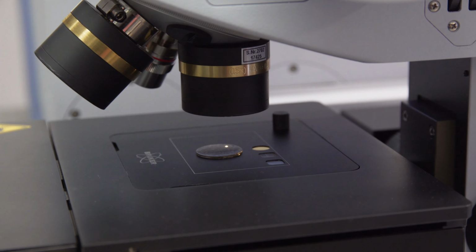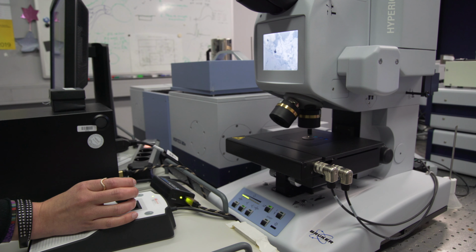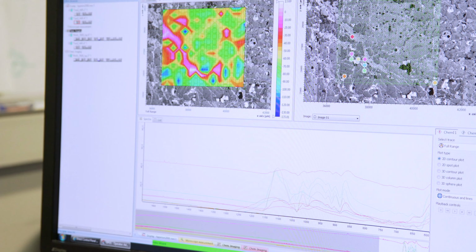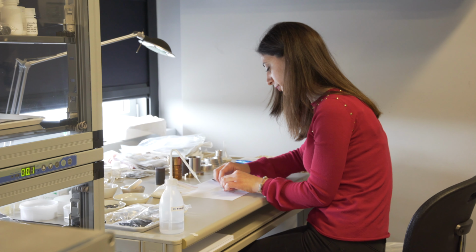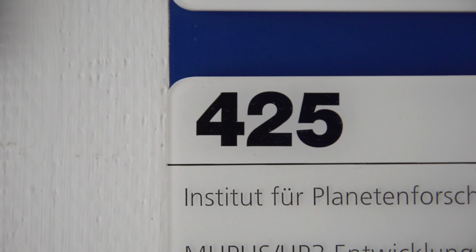The microscope is a special capability that we recently added to our lab and allows us to measure especially extraterrestrial samples. Like this one is a meteorite that we are measuring in a thin slab, or we can measure powder in case we bring back to Earth a very limited amount of sample from asteroids and so on. And in fact, we are working on this possibility on several missions.